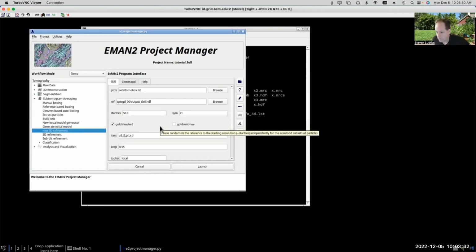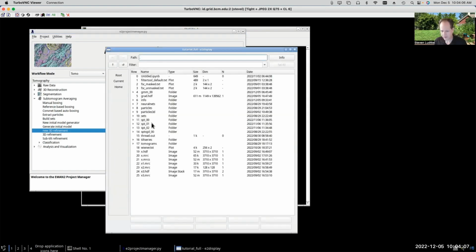Now, it turns out, like pretty much all ribosome data sets, there's a fair bit of heterogeneity present in this data set. There's a small set of bad particles which got included in this data set, and it always gets included irrespective of how I do the picking. But there's not very many particles. And there's a ratcheting motion, and we can actually see things like tRNA associating and dissociating and stuff like that.